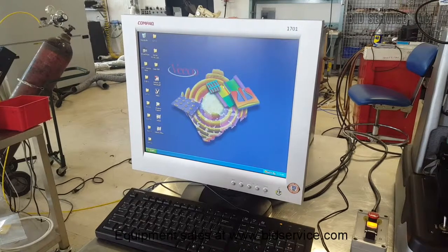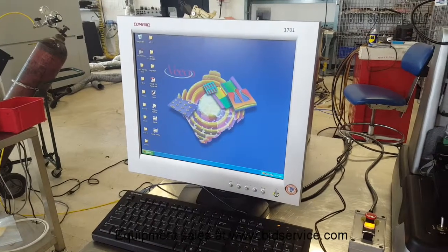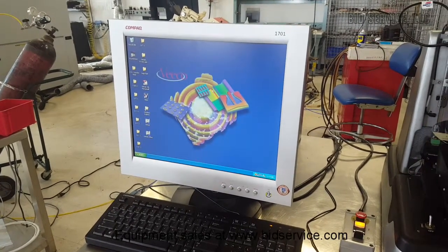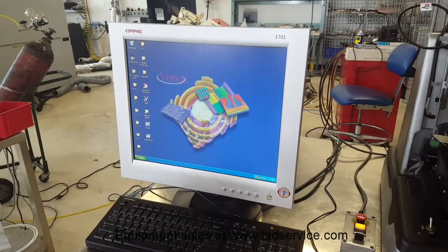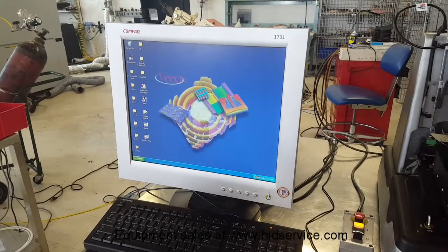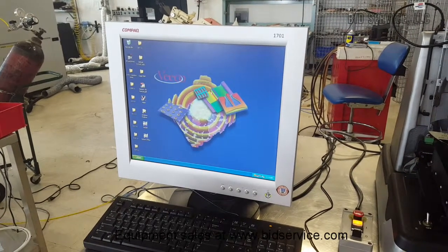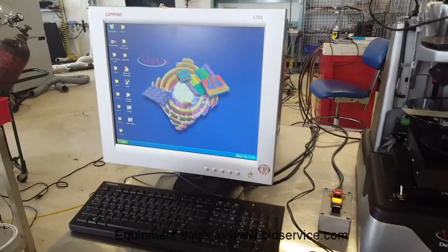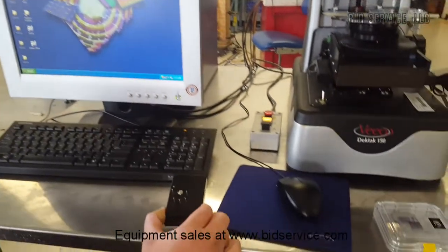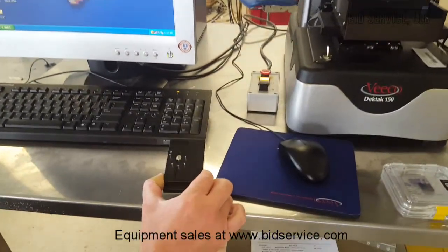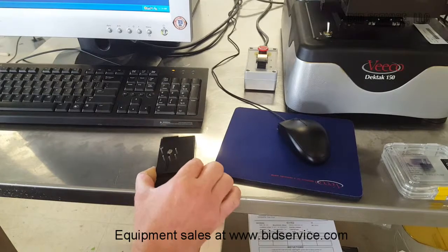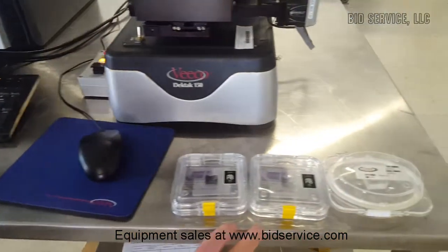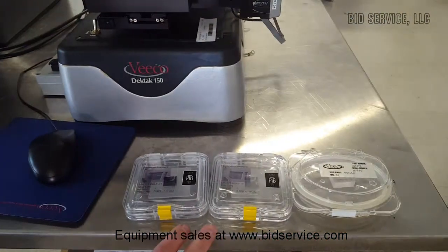This is the video demonstration on the VEECO DECTEC 150 stylus profiler. The unit runs with Windows XP operating system. The unit will come with the stylus exchange tool — this is how you will change the stylus in and out of the system. It will also come with the three standards that you purchased.